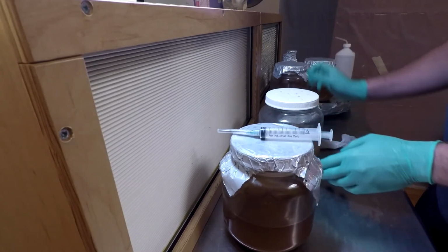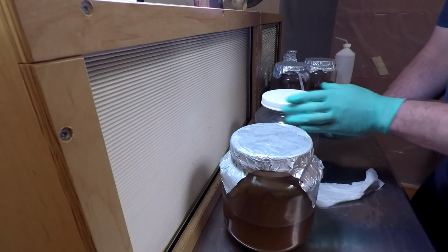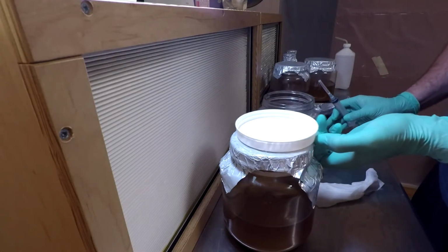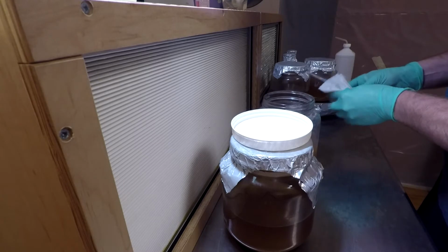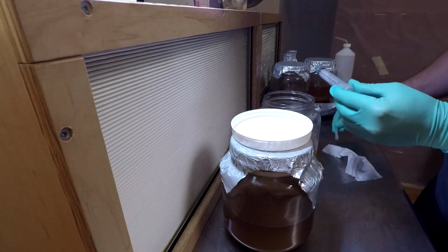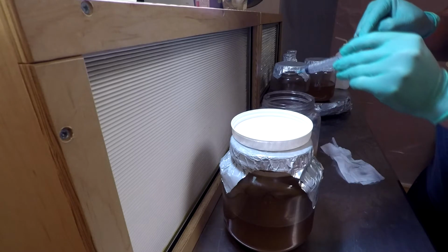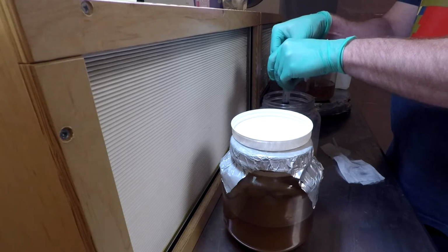So, go ahead and take this. I'll use this jar at the moment to have something to put this lid up on. Carefully set that like this. Wipe down my syringe, make sure I haven't touched it over. Now, because I'm dropping this syringe into the jar, I want to make sure I don't touch anything on the lower portion. Nothing you want to be touching is going to be in between the jar and what you want.